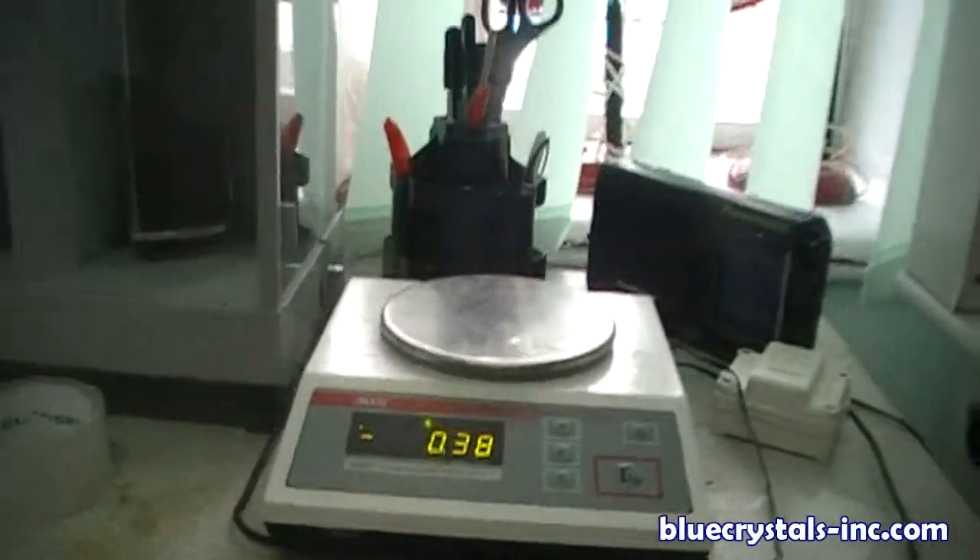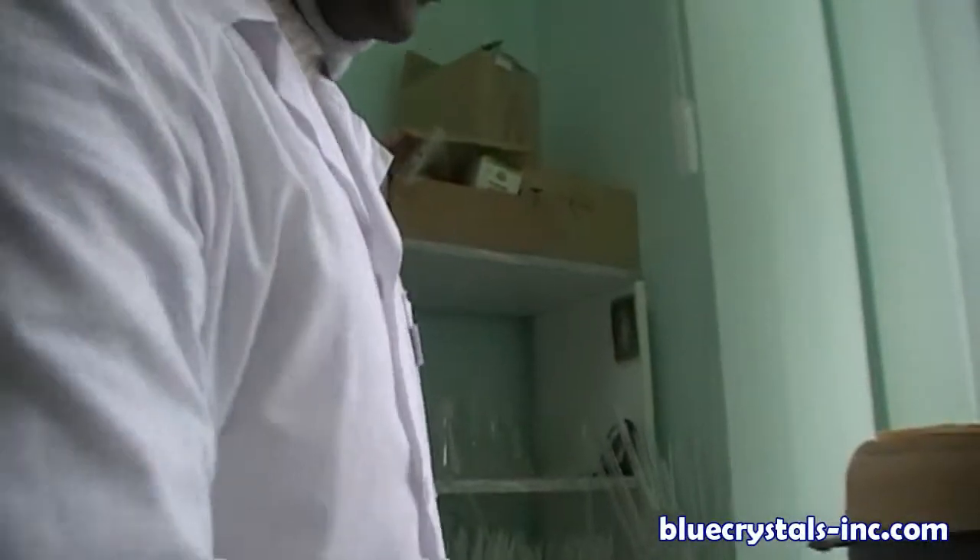Here is the chemical balance. You can see — just measure the weight you need, exactly what you need.